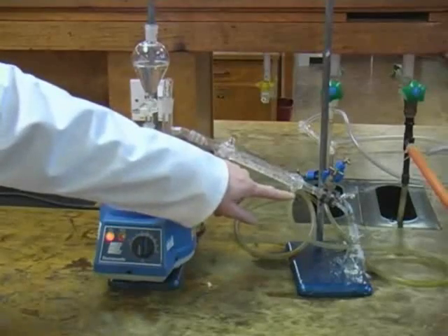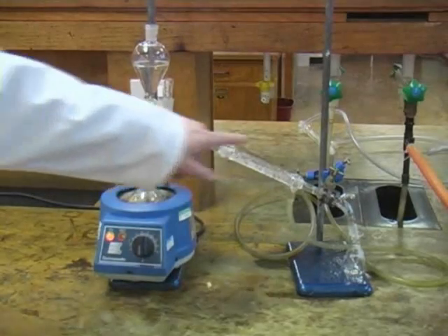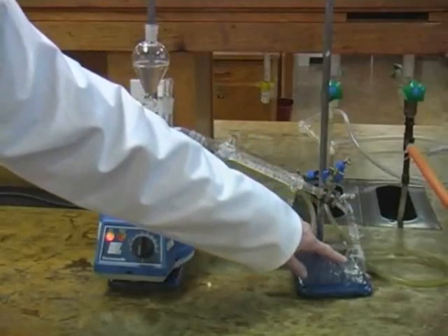Here we have a condenser with water running from bottom to top, and after the condenser we have a receiver running into a conical flask.